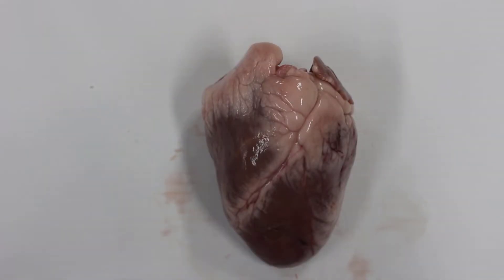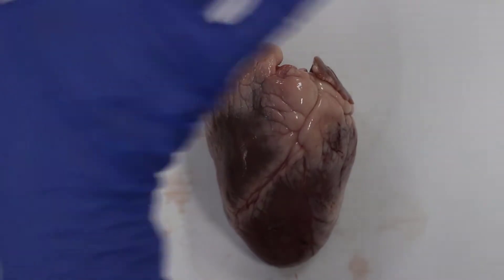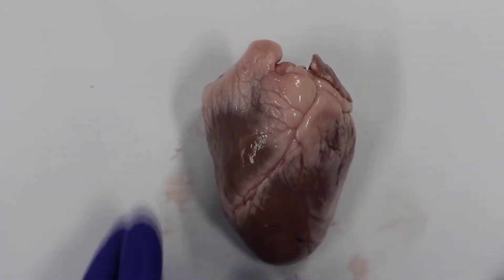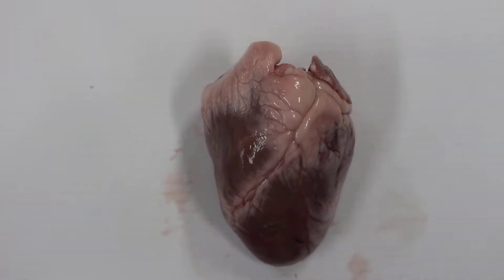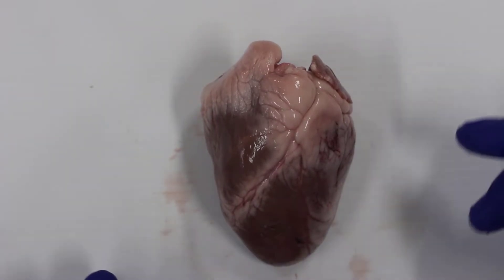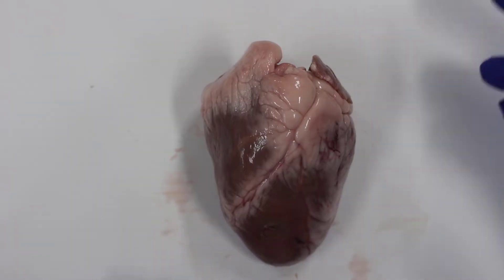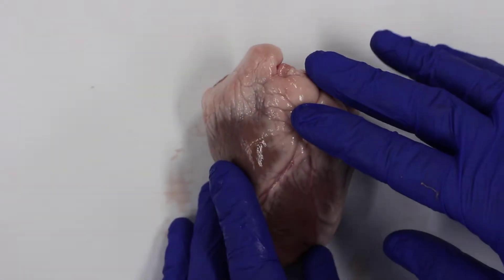Science Steve here with Lauren. We're going to do a dissection of a heart. This heart has come from a lamb — we got it from the abattoir, which is where they prepare meat, so it's food grade, but of course we're not going to eat it.